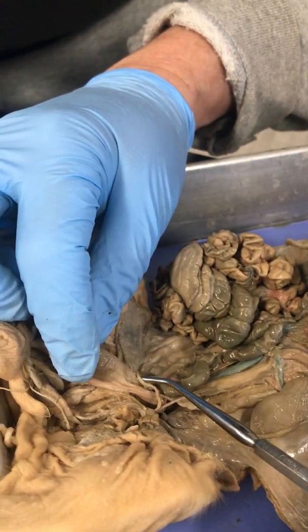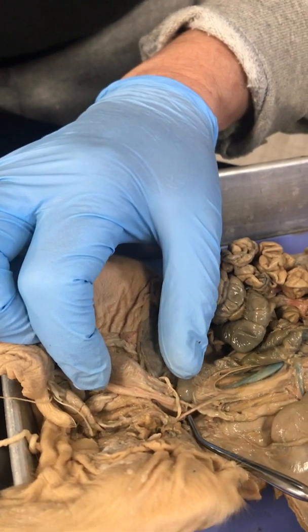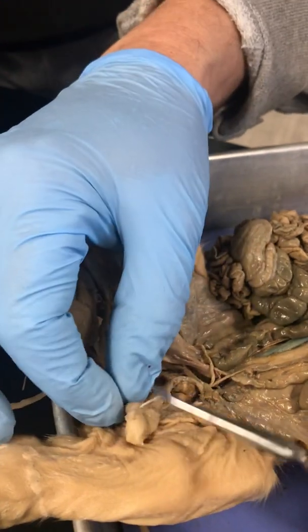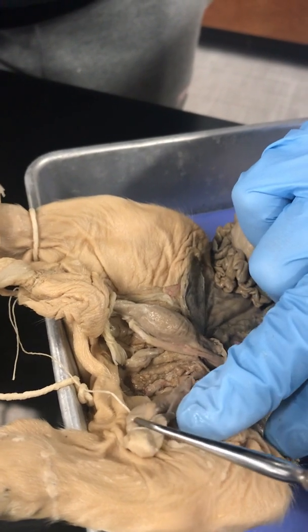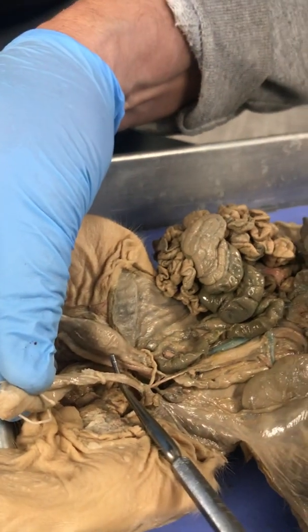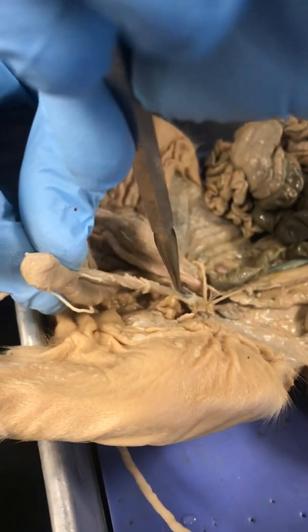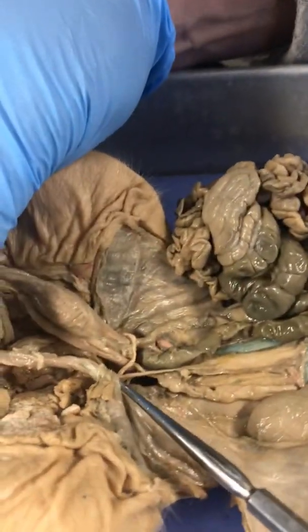One from either side, and then you have to feed blood to the testes, and that is through this vessel, the testicular artery. Here would be a testis laid out right here. I think it's better on this side, so you can see the testis, and then what's that mass right beside it? The epididymis. And this whole structure you see here is the spermatic cord. The point where it penetrates through the pelvic cavity wall, right there, would be the inguinal canal.